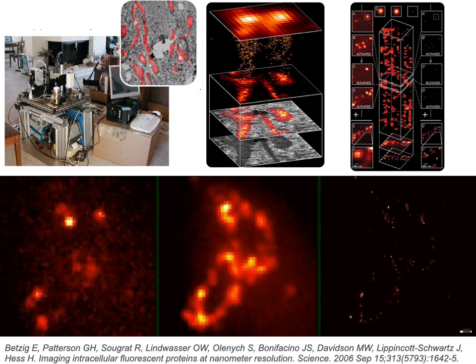In a very simple way, on the bottom line, what you see are single molecules on the left side. Single molecules of one acquisition, and then you switch them on, you watch them counting photons, and if you superimpose one on the other, what you get is the information in the center, an old image. But if you calculate the center with the precision of localization improved by a factor square root of n, and you make this map, so you add this information, you have a better resolved image on the right side.